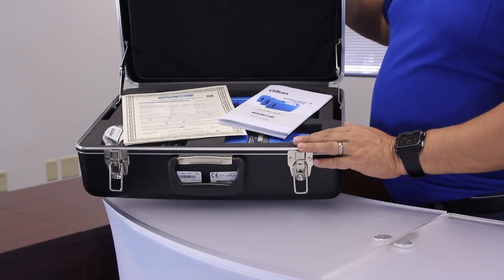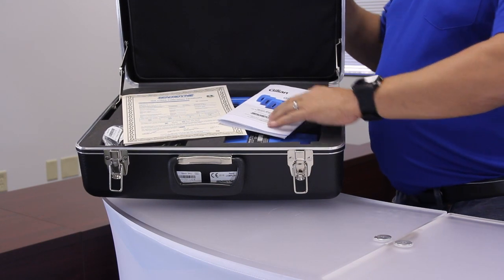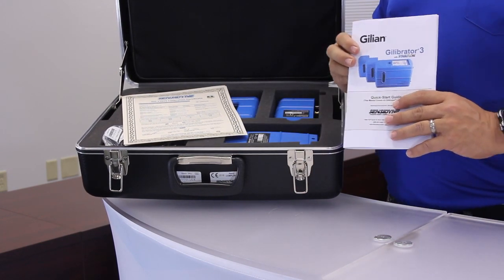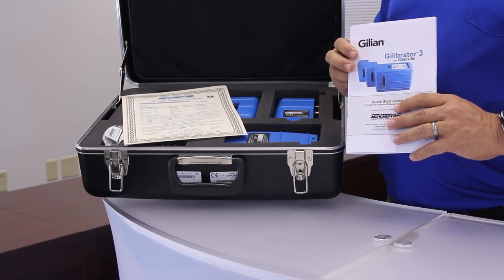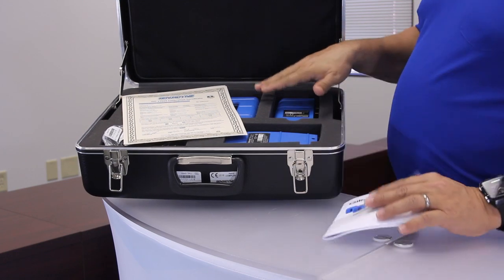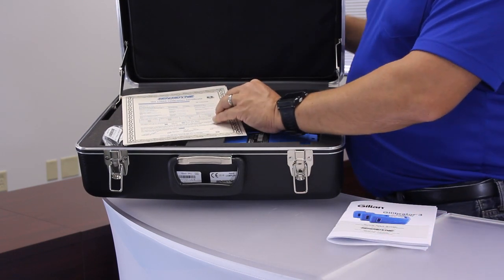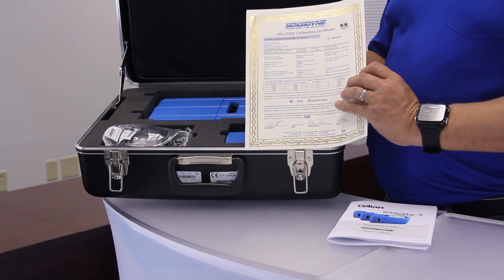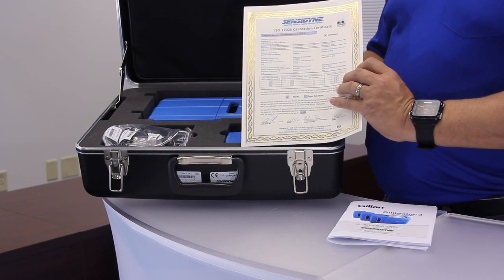Once you open the case, you'll see the quick start guide inside. We recommend reading and keeping this handy for future reference. The quick start guide, as well as the operation manual, can be found on the included SD card located in the back of the Gilibrator base. Now under the quick start guide, you'll find the 17-025 calibration certificates for the flow cells, and a certificate of performance for the base.